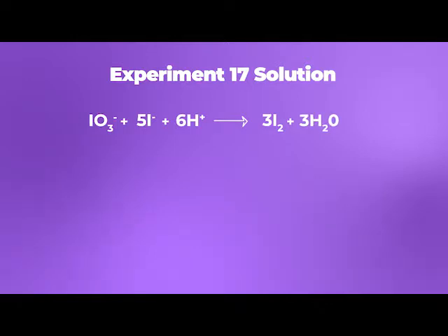So let's look at the explanation for the reaction and how we determine the KSP, which will help us determine the molar concentration of calcium and iodate in solution. The formula that we are using for the first part is iodate plus 5 iodide ions in solution plus acid produces 3 iodines plus 3 water molecules. Once all of the iodate has been transformed into iodine, we can then do the second part of the titration, which is to convert the iodine back to iodide using thiosulfate and an indicator.